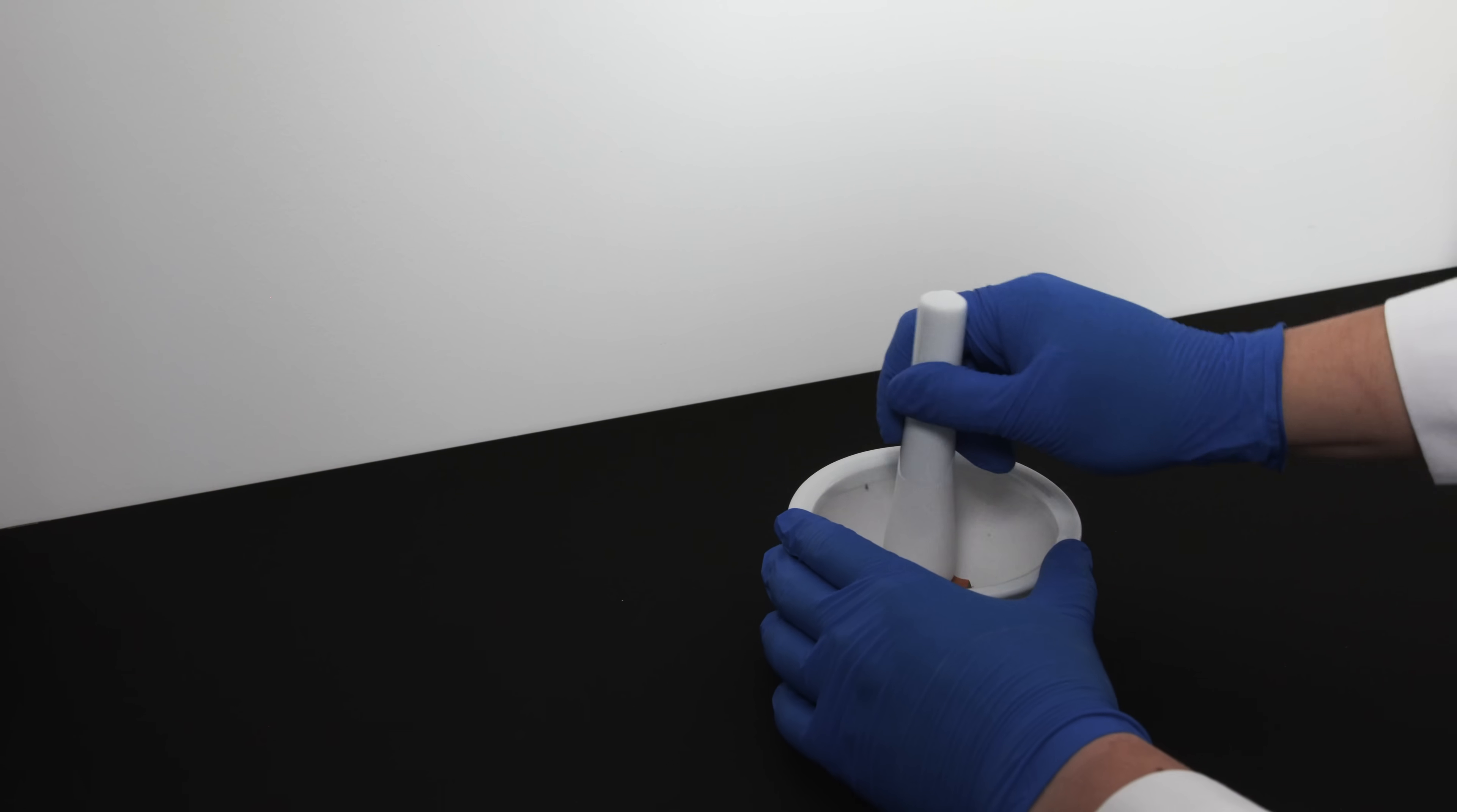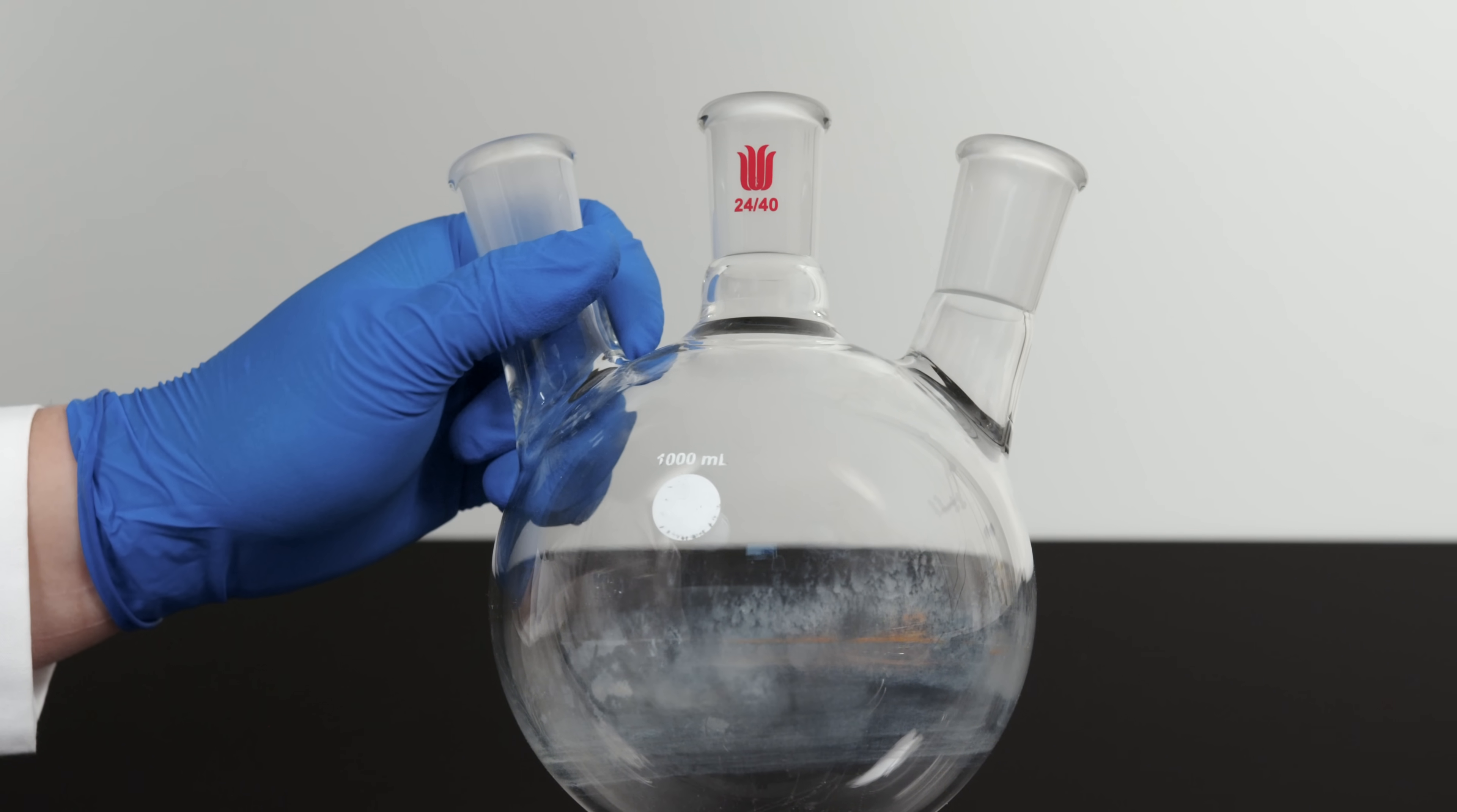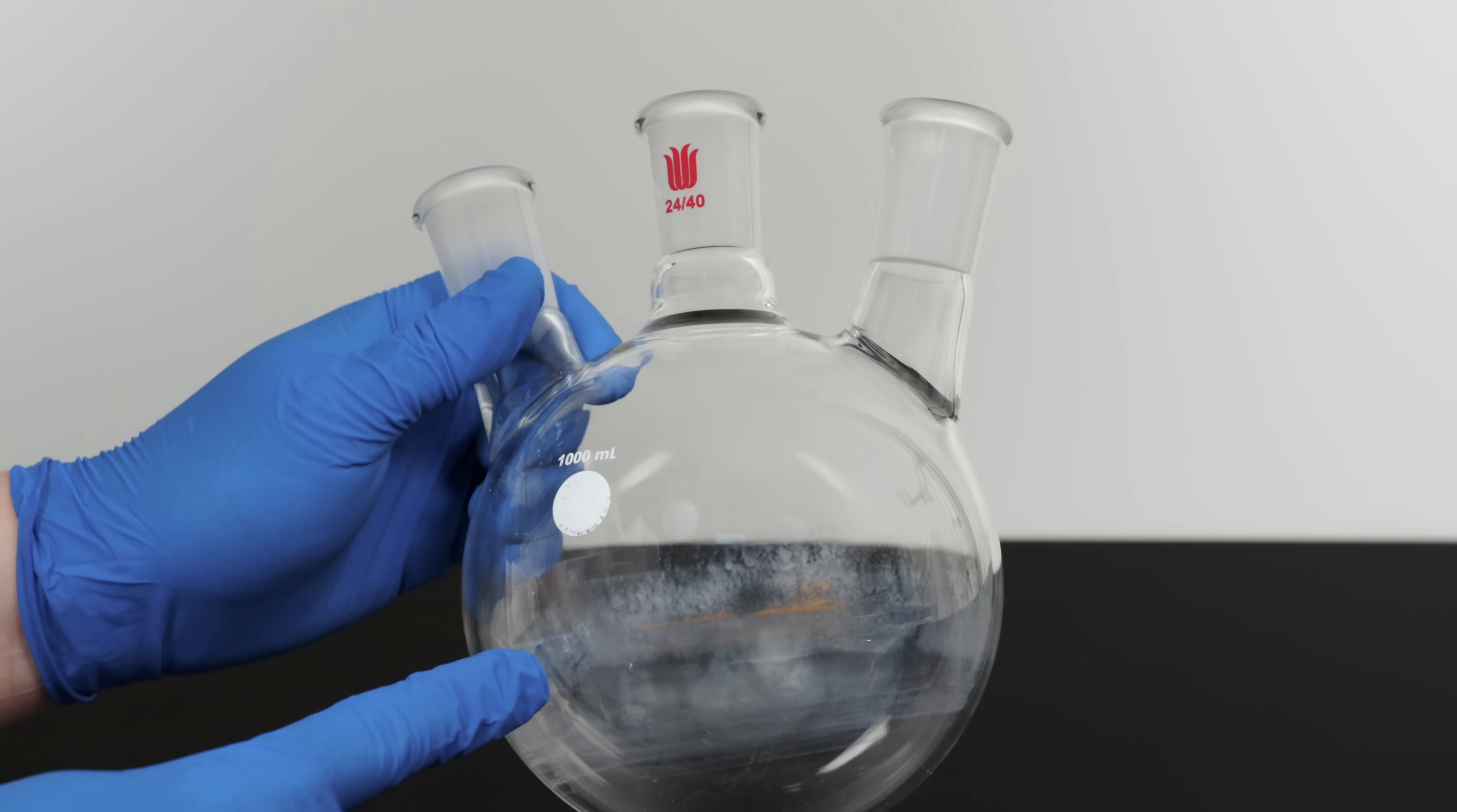The fourth one is broken clay pot. It is one of the porous materials which can withstand the heat of boiling sulfuric acid while providing the required nucleation site. It is my personal choice of boiling chip when it comes to boiling sulfuric acid. The major downside is that it will leave scratch marks on the glass surface on prolonged distillation. So you might want to dedicate a flask for sulfuric acid distillation just to minimize damage it can cause using broken clay pots as boiling chip.